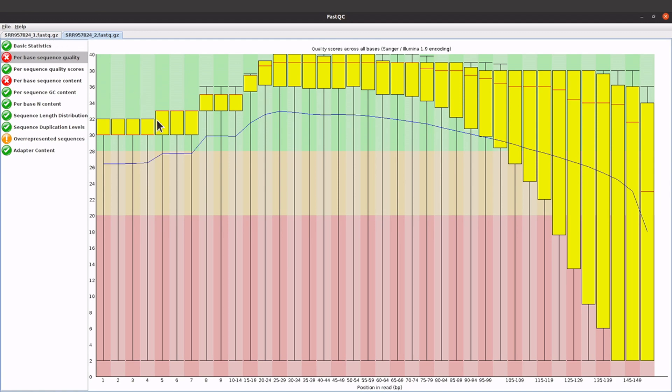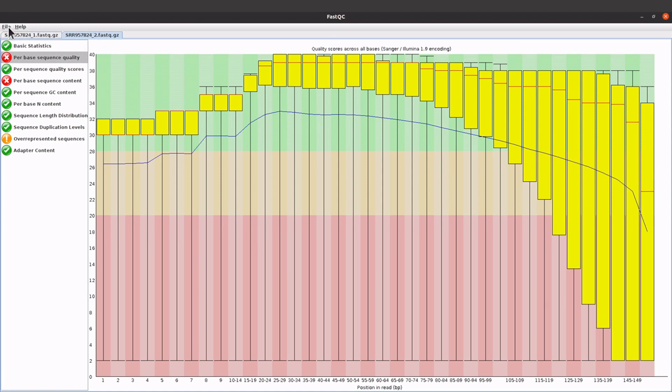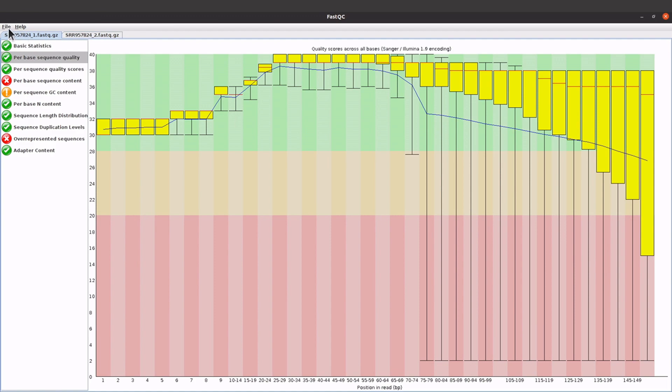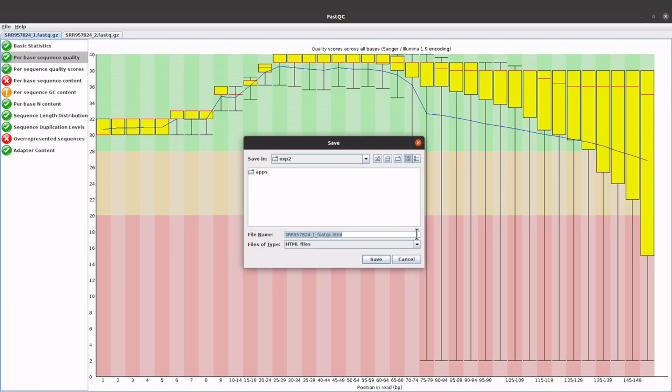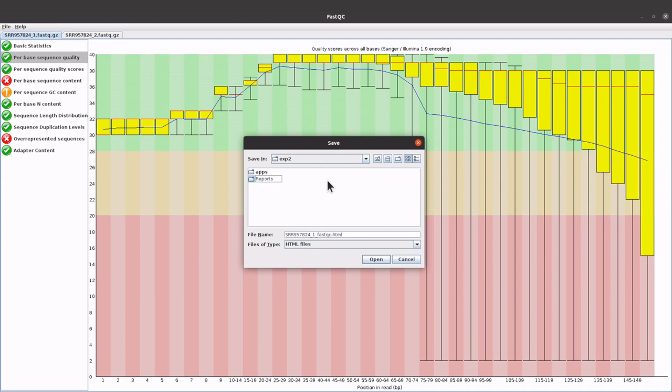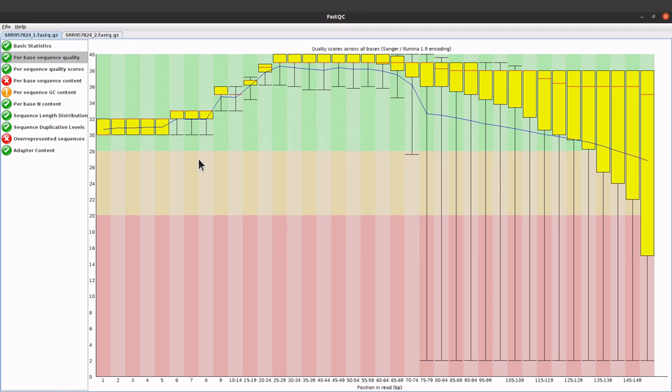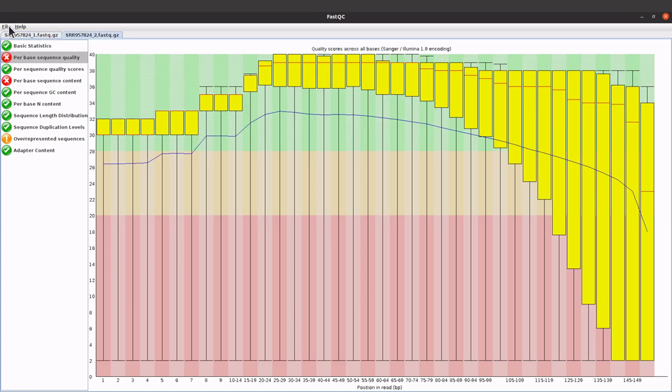Now we have used the graphical user interface to run FastQC. After you are done, you can go to File and you can also save the reports here. Let's save both of them. You can save the report, so click on save reports, and let's just create a directory, let's say reports. Let's click on this one and also save the reports. We have saved them there.